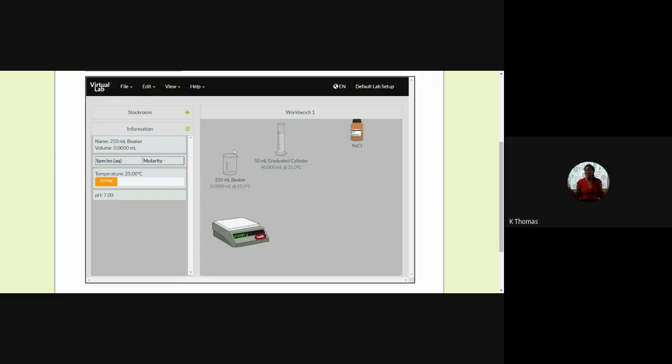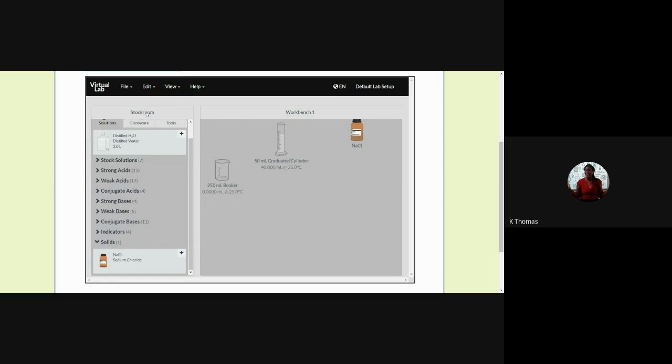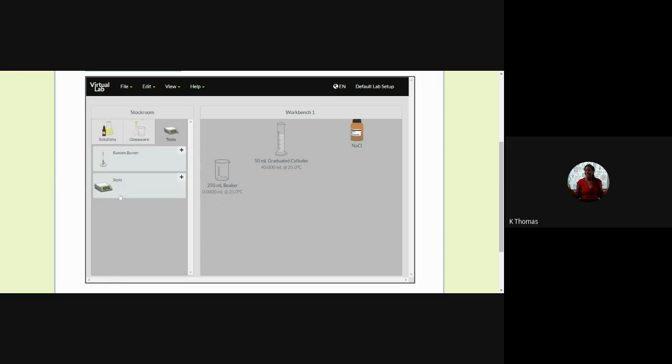Not sure what's happening, but when I press tare, it should zero the scale. Alright, so straight away, this is an error happening in the lab that I could prevent. So this is limiting my research right now. So I'm going back again.